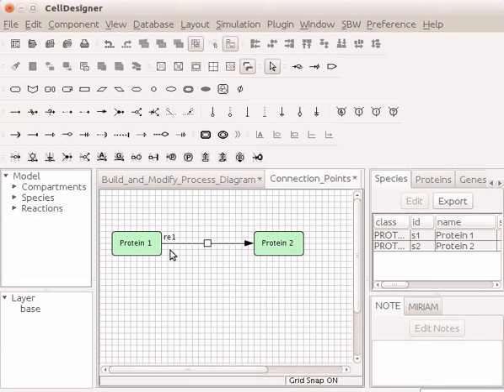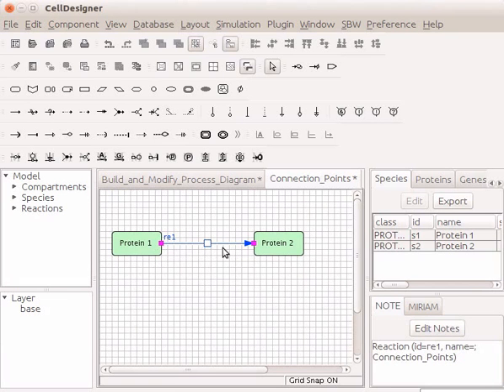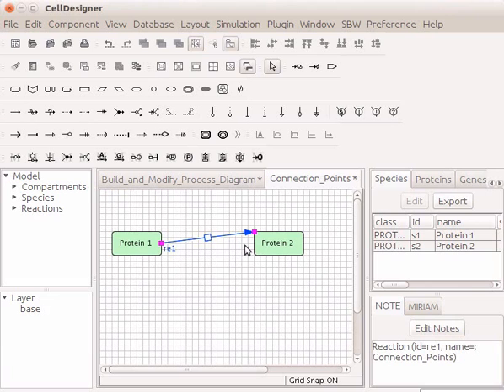Next, we will align the reaction line. Click on the state transition reaction line between Protein1 and Protein2. Note that the two process nodes on the reaction line get highlighted. If we hover the mouse on either of the two process nodes, a plus sign appears. Click on one of the process nodes. Now drag and place the pointer on the preferred connection point. Click anywhere on the draw area to uncheck the highlighted process nodes.